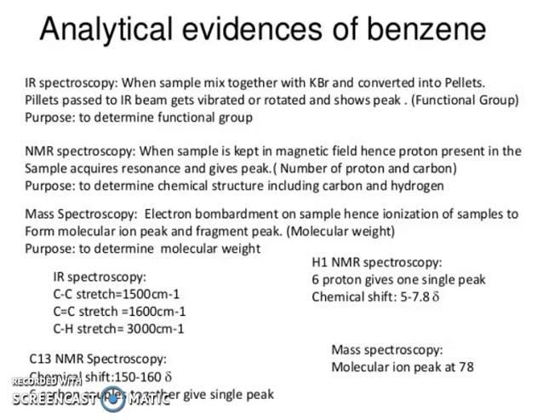When a sample mixed together with KBr and converted into pellets is passed through an IR beam, it gets vibrated or rotated and shows peaks. That is the functional groups. Purpose: to determine the functional groups.